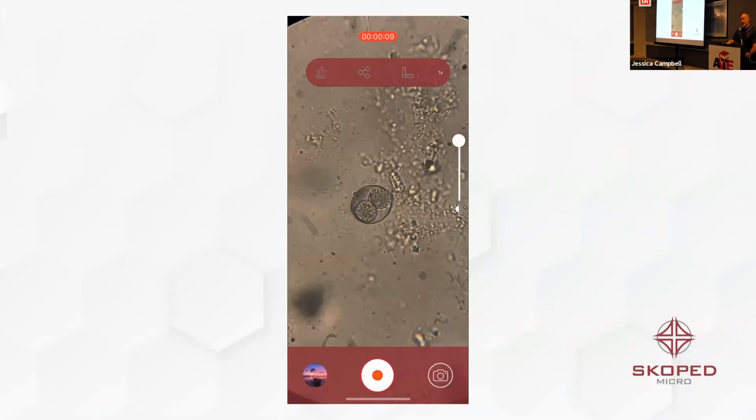And so now if you change your phone every year, that's a bad deal, by the way. But if you're like a normal person, you're going to save it. My dad saved his, I don't know how long, but if you're going to get 2 or 3 years out of it, your eyepiece is going to be good forever. We sell the next case for about $60. So it's not like you're breaking the bank. And if you're using one of these, this could be your phone case too. I think Kiara's pretty much bedazzled hers. She's got all kinds of crazy stuff on hers. If you look at doing something similar with a microscope, we are way less costly than getting a digital pathology setup.